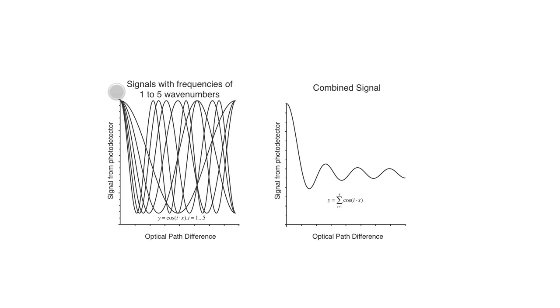But one thing we notice is at the very beginning, they're all lined up. All right? And after half a period, look, 3 up, 3 down. They're kind of canceling each other out. And really, there's no point along here where they're all lined up again, is there? I mean, they're kind of in between lined up to the worst case here at the end. They add up to something that looks like this combined signal. Starts strong, settles down. Basically, there's a center peak and then what we call a wing that just goes out.